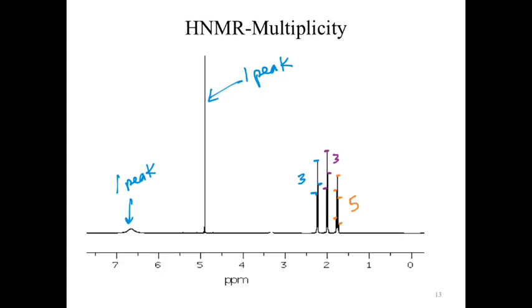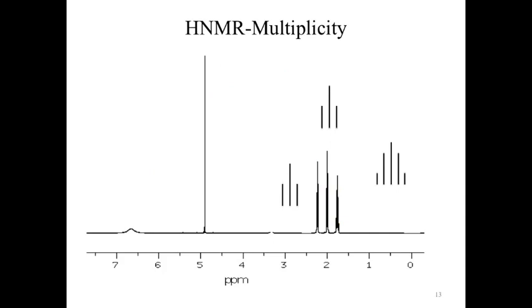Take a look at your spectra packet. Hopefully you've already started to scan through that. You'll notice that when it's less obvious, I've provided zoom-ins or blow-ups of that range much in this fashion, so that you can actually see and interpret what's happening with those peaks.